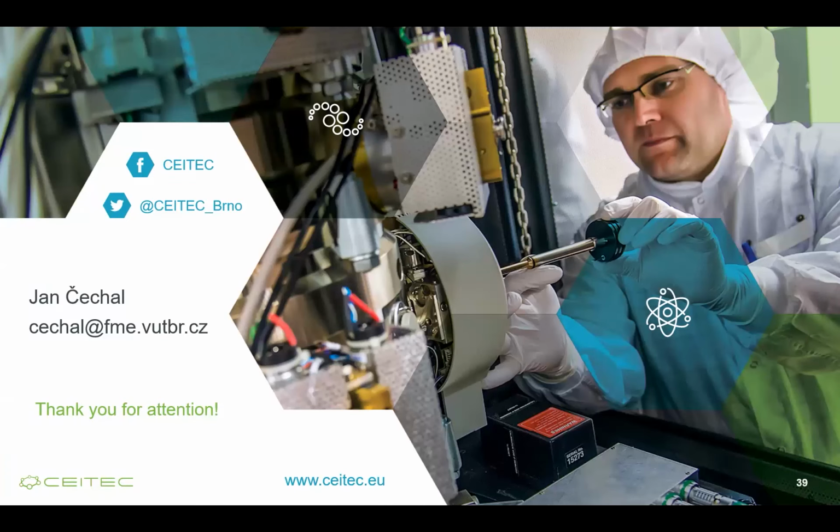We tried to use deposited graphene on the sample, but it was not possible to UHV clean, and we couldn't see diffraction. And if you don't see diffraction, you lose half of these nice possibilities. You can still see some image, but it is the same image you can see in a standard electron microscope. So there is no advantage to take it into LEEM.